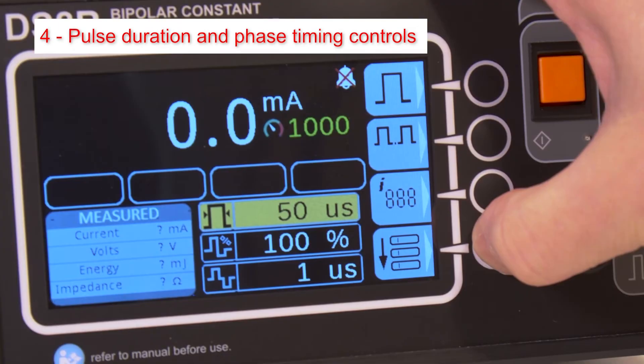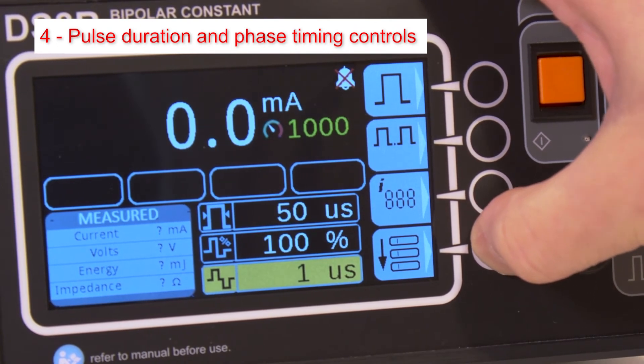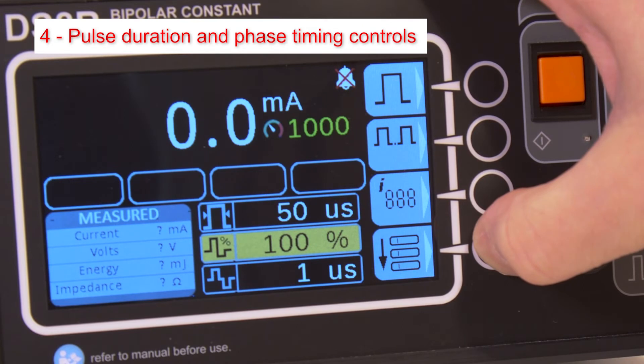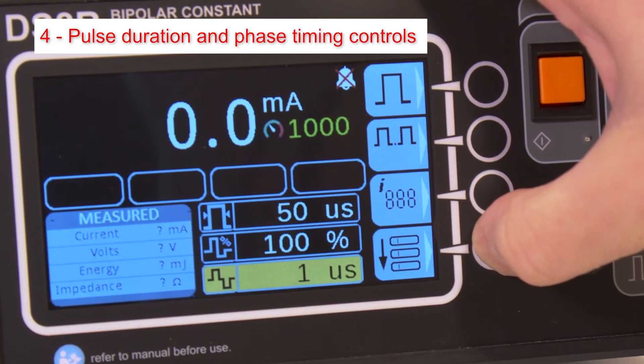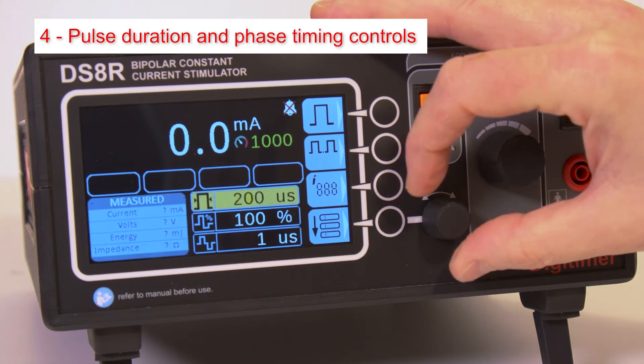The fourth button cycles between settings for pulse duration, recovery phase — i.e. how symmetrical biphasic pulses are — and interphase interval. The parameters for each are adjusted using the associated dial.